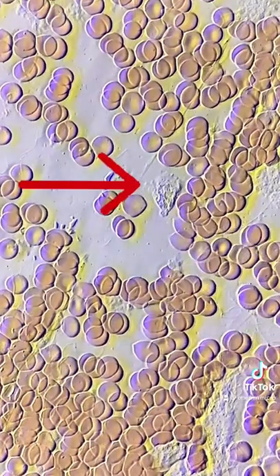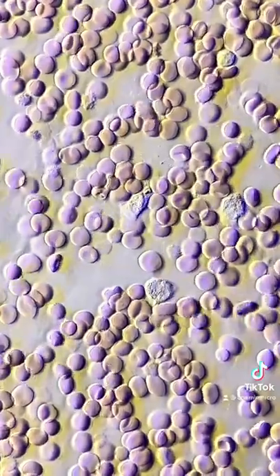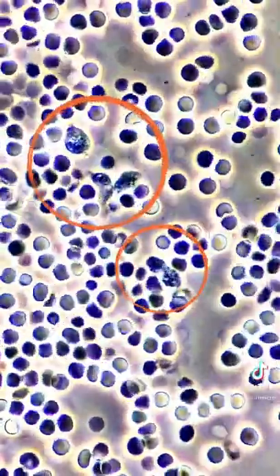Shown here is my white blood cell scavenging my blood for any foreign particles. After I added the bacteria, more white blood cells started to move around.